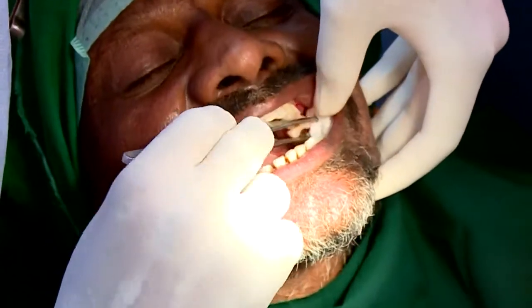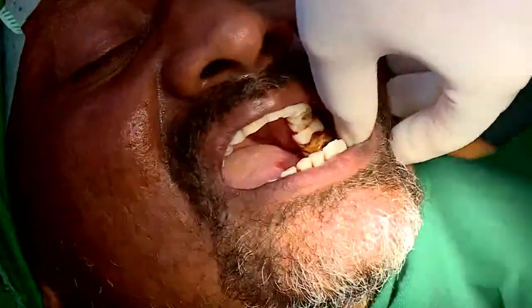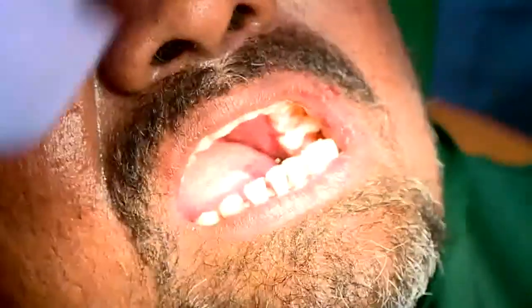We have other fixatives too. If you go in for different microscopy, you have to use other fixatives. For electron microscopy, you have to use glutaraldehyde. So fixatives vary, but the common fixative used in clinics will be formalin.